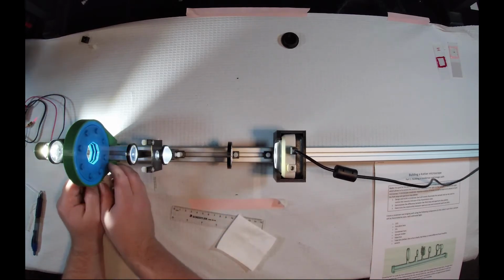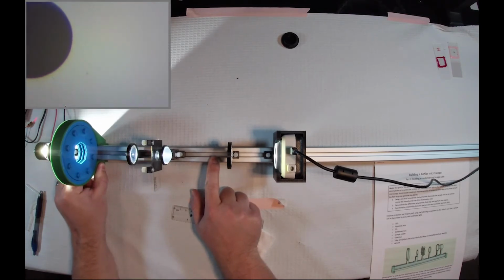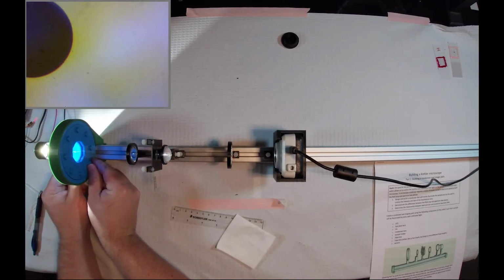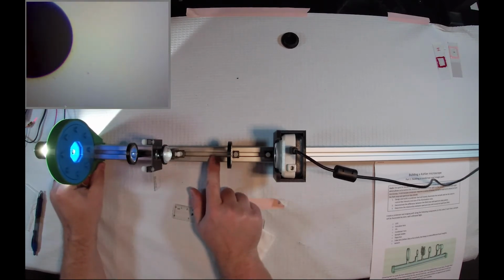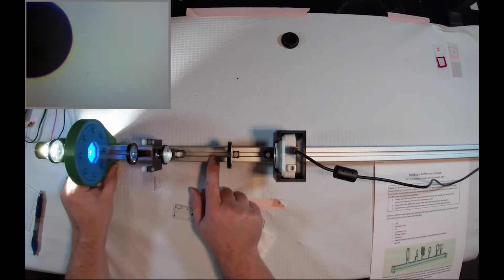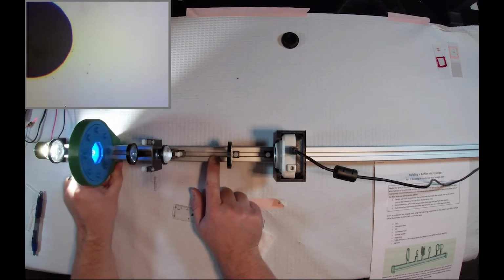So we're definitely not finding a plane that's conjugate to our sample. So we need to sort of try to find that. So let's try to move this back a bit, and I will partially close my iris. See if we can find a plane where our teeth appear on our sample.